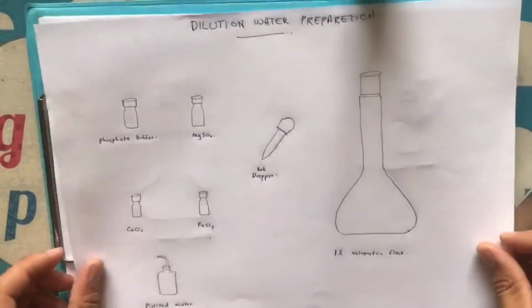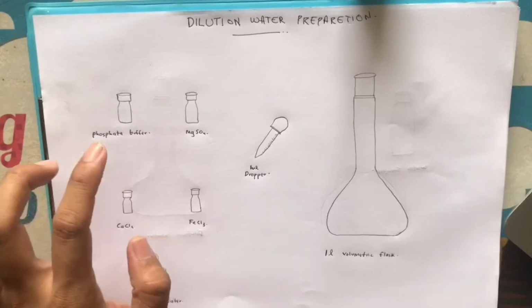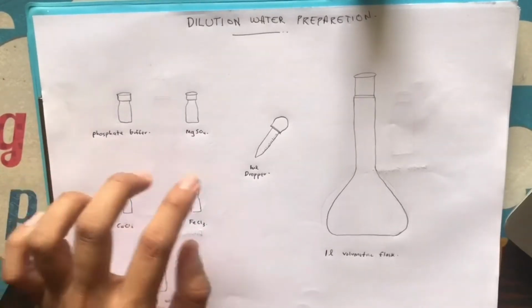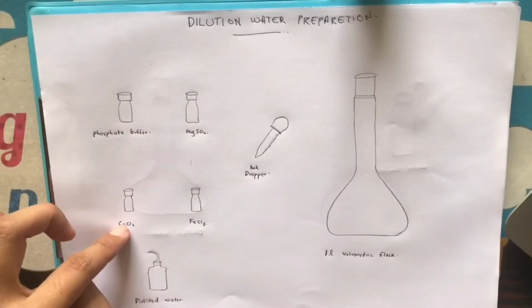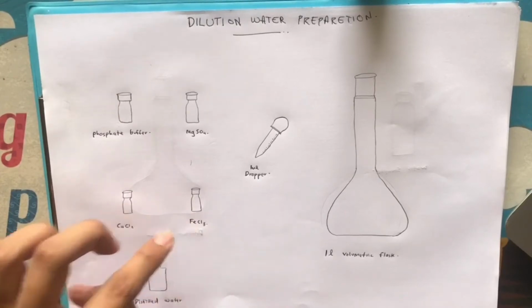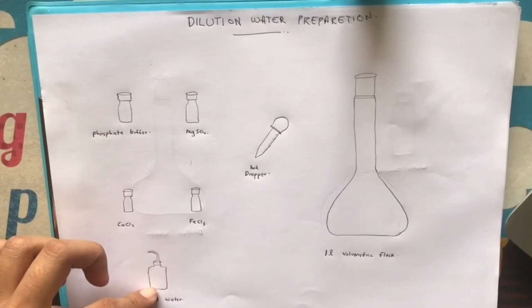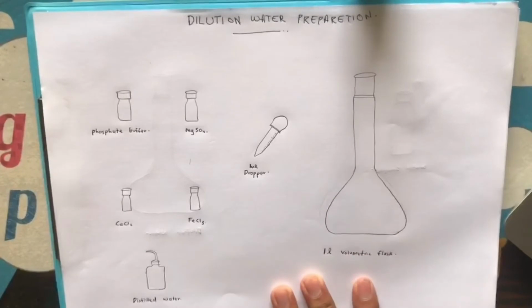Right. Next, we go to step 2, which is preparation of dilution water. Prepare dilution water by adding 1 ml of phosphate buffer, 1 ml of MgSO4, 1 ml CaCl2, and 1 ml FeCl3 solution to distilled water and bring the final volume to 1 liter using a volumetric flask.